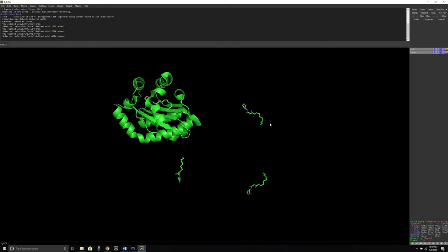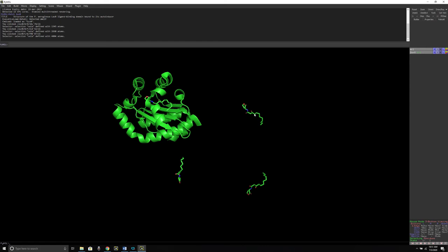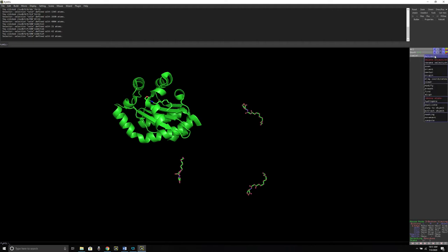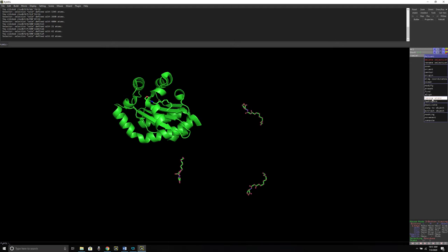The ligand is still there, so I also need to remove these extra ligands. For that, I'm going to go again to the mouse control panel and select residues. Because now I am selecting ligands, I need to change it to residues. After that, I'm going to click on these ligand molecules. And again, I'm going to go to the selection tab to the action panel and remove the atoms.